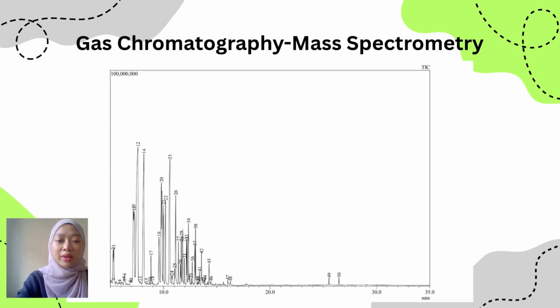This compound reflects the complex hydrocarbon composition typical of commercial gasoline. Detailed identification data, including compound names and retention time, are provided in the full report.